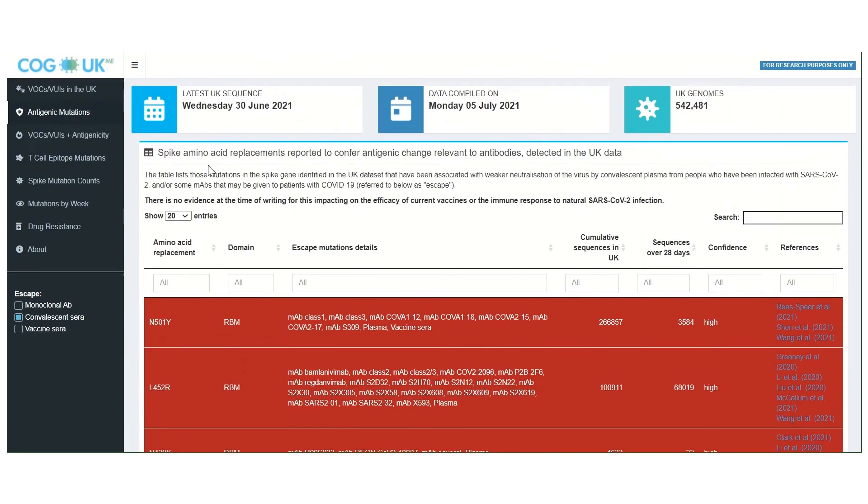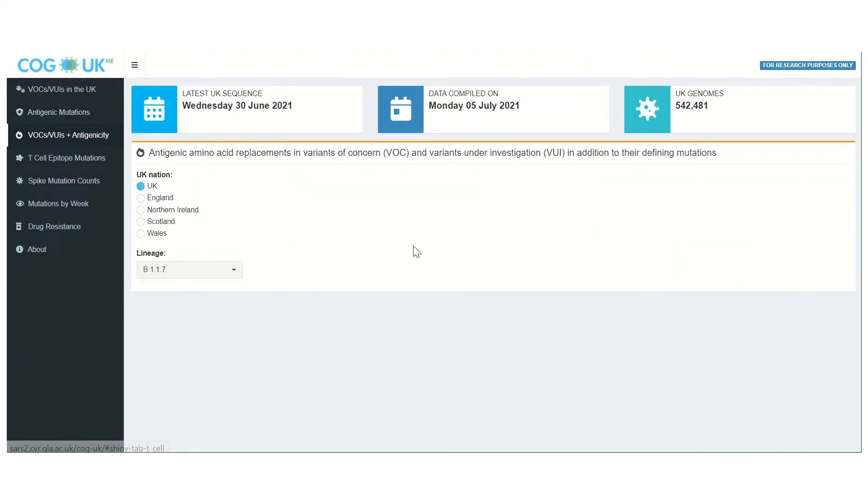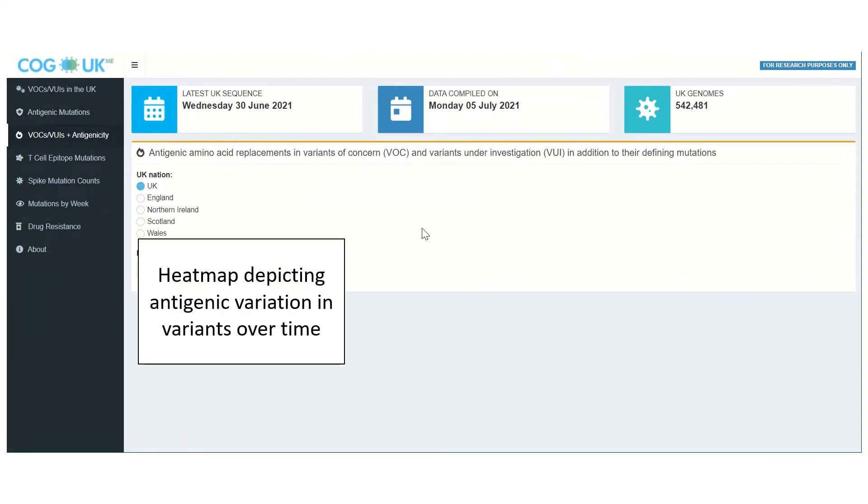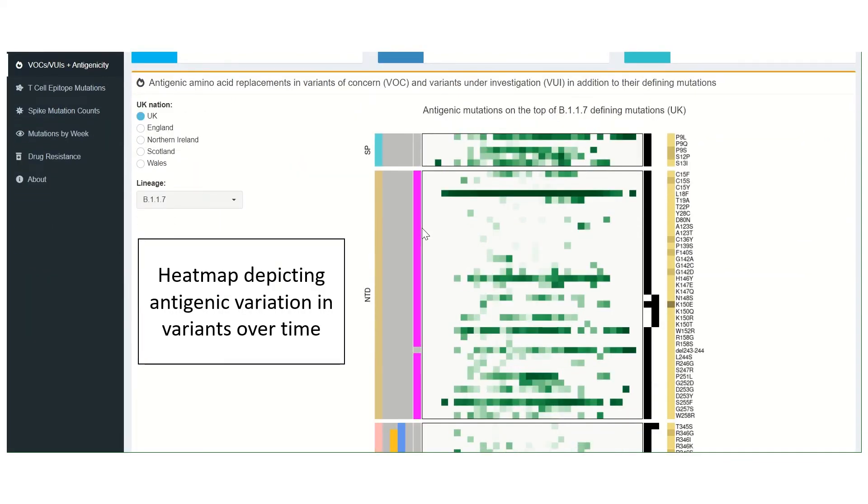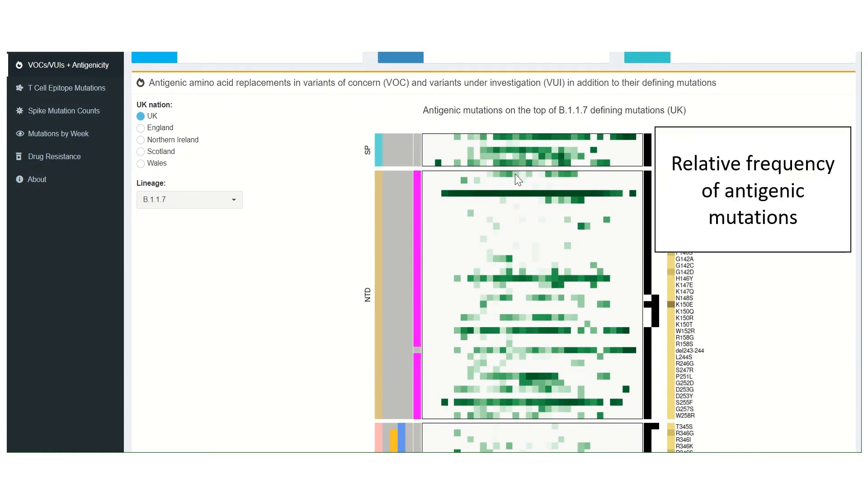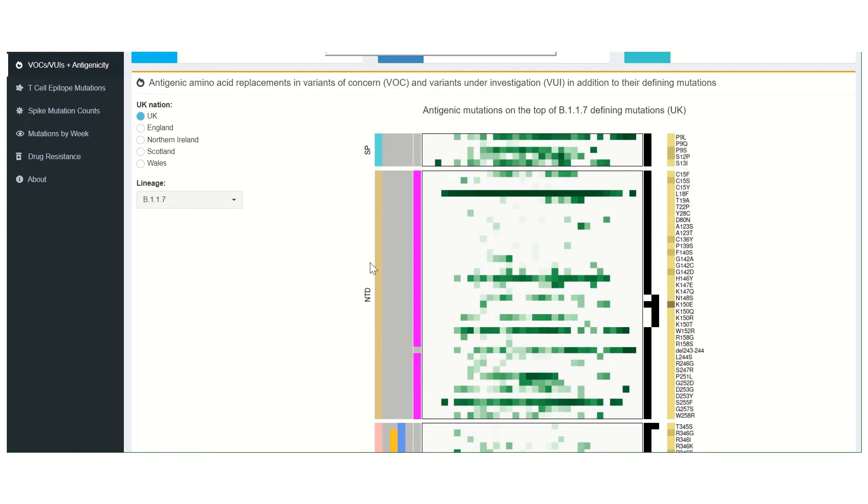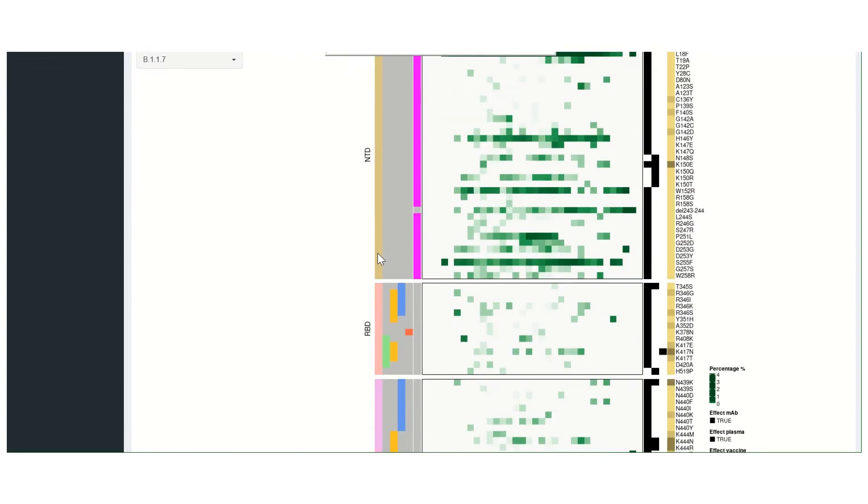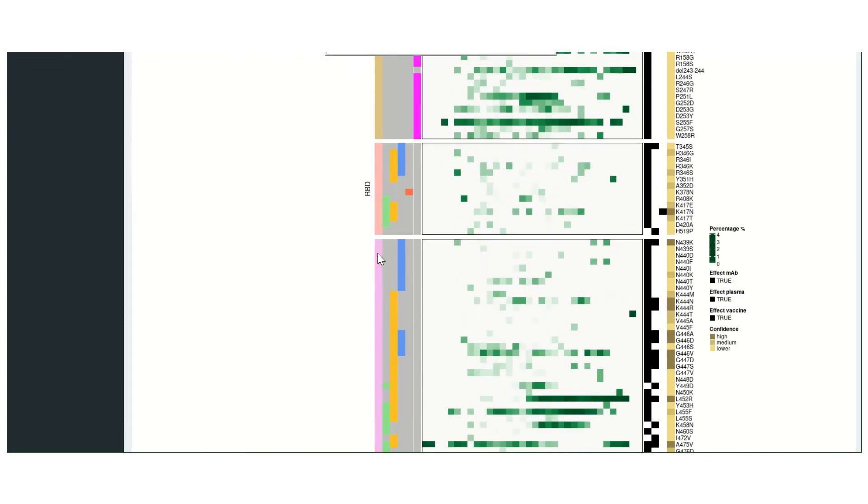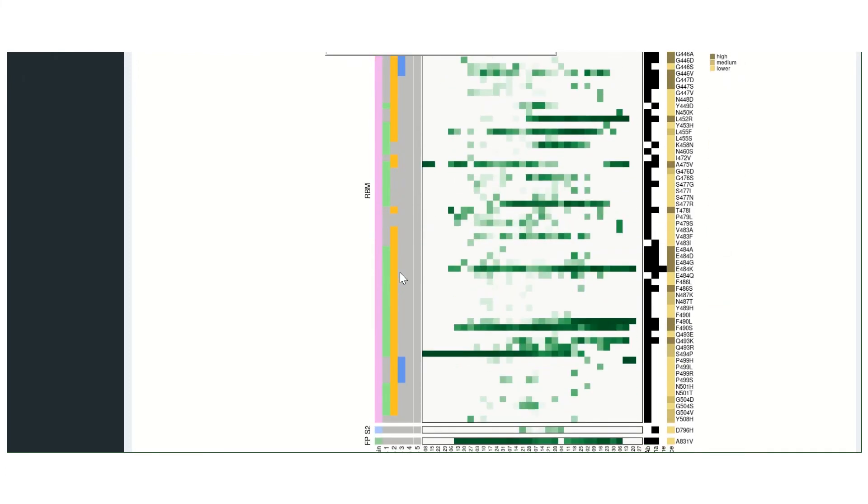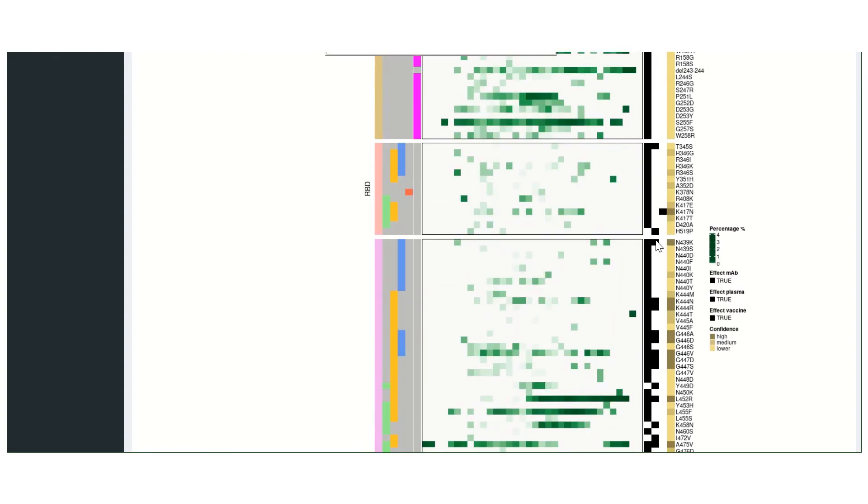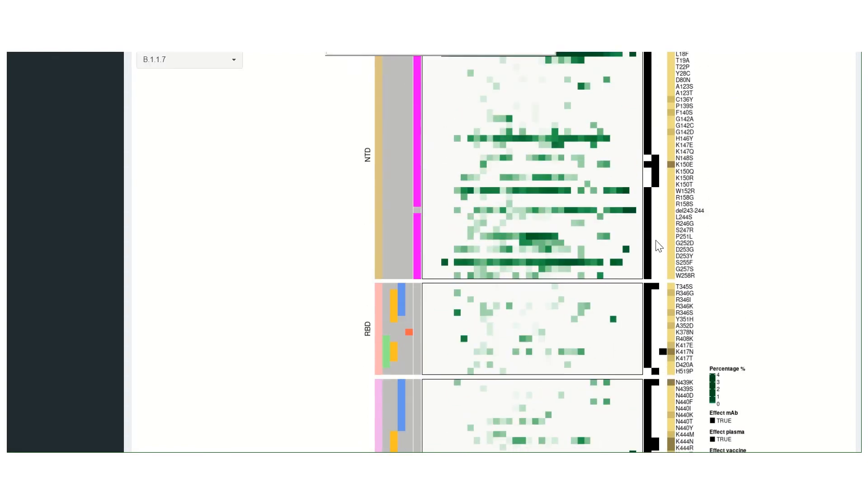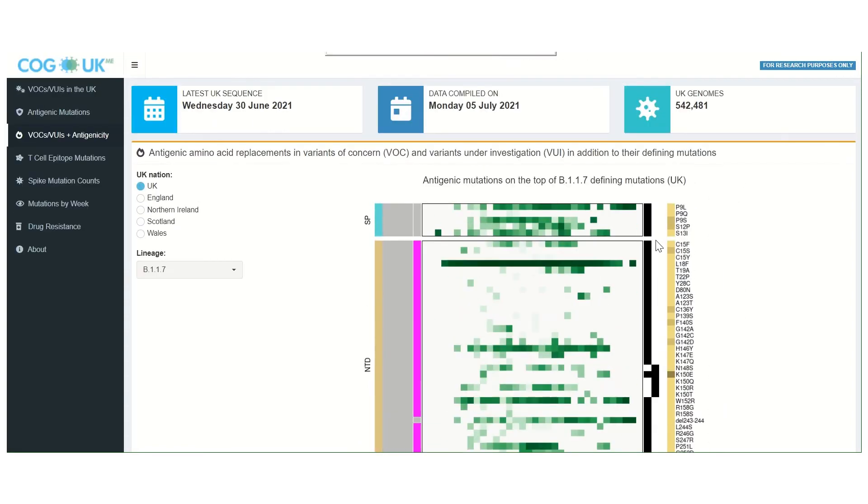Selecting the VOC/VUI antigenic tab displays a heat map graphic depicting antigenic variation present in specific variants over time. Each green box reports on the relative frequency of a known antigenic mutation in that variant in a specific week. The left hand side of the graphic depicts the subdomains of the spike protein and the sites to which different antibodies bind. The black squares on the right depict the type of antigenicity that each variant is involved in modulating.